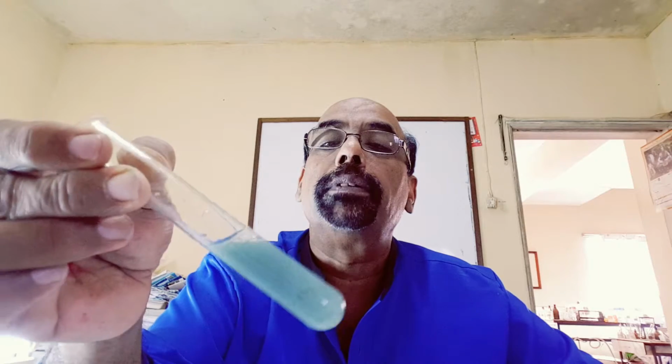If I allow the green precipitate to stand for some time, a brown precipitate will be seen. If you observe carefully at the top of the solution, it starts becoming brown. So I leave it aside for some time, then we'll observe again. Iron 2 ions oxidize to iron 3 ions. The oxidation of iron 2 ion is rapid in presence of hydroxide ion.